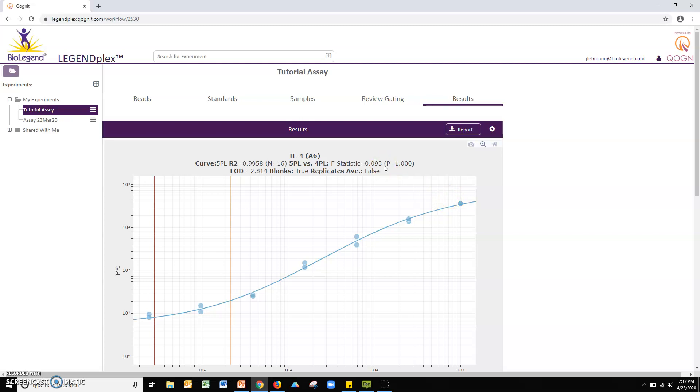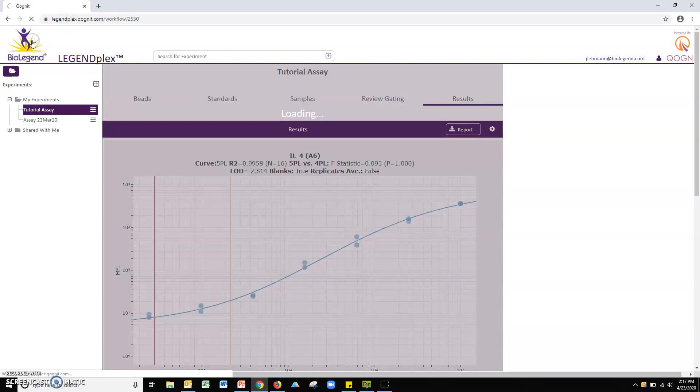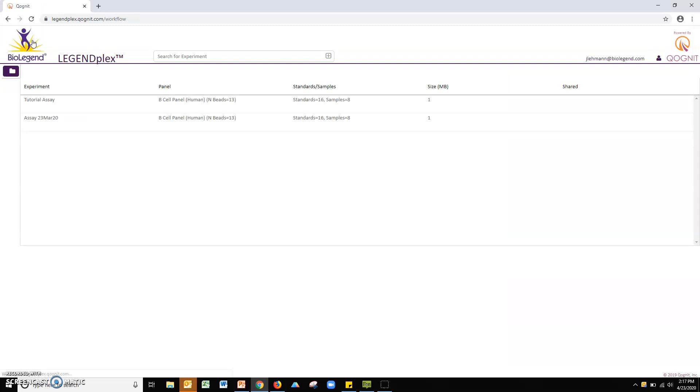Finally, should you ever wish to return to the landing page, click the BioLegend logo at the top of the left screen. Please remember to read the user manual for a complete explanation of all the features in the cloud-based LegendPlex data analysis software and don't hesitate to contact us if you have any questions.